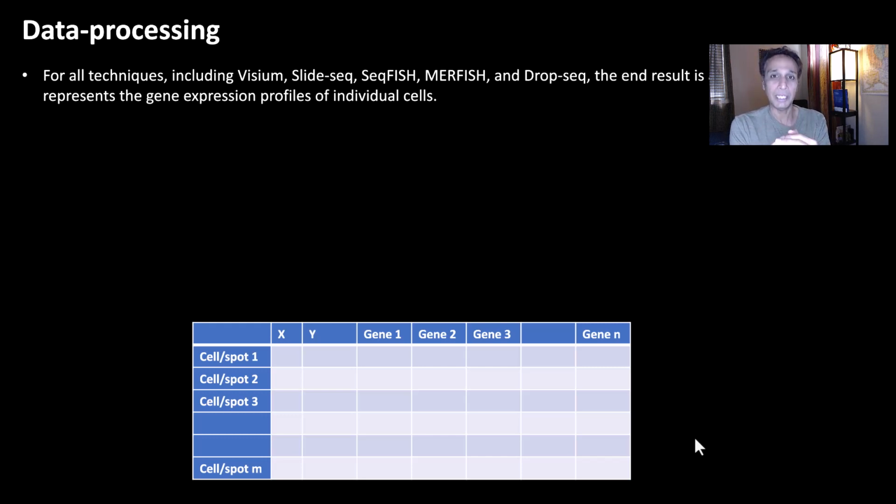I mean, these droplets. The idea is that in each droplet you will have a bead that is barcoded, and a cell that gets attached. So this is how you can also study at a single cellular level. But of course, in these cases, you'll also have some of the beads with no cells, and some of the beads with multiple cells, so you need to do some correction. The way you handle the data, the way you clean up, is slightly different depending on what type of technique the data is coming from.